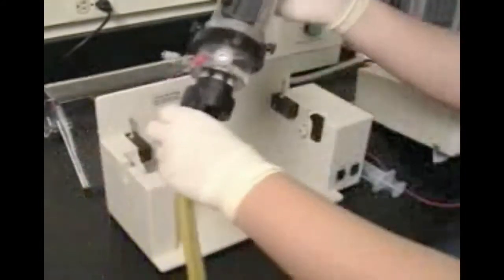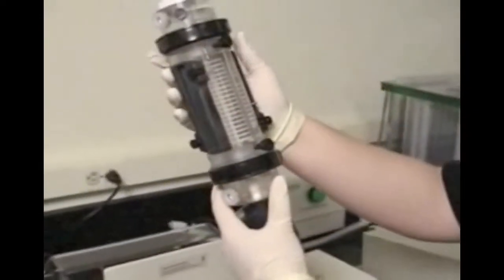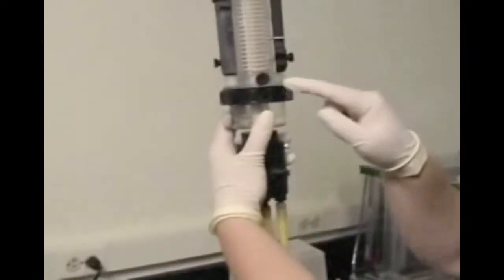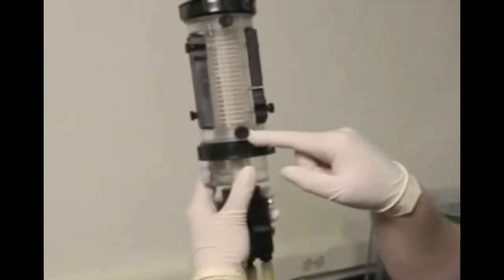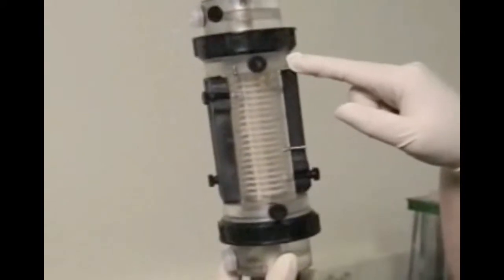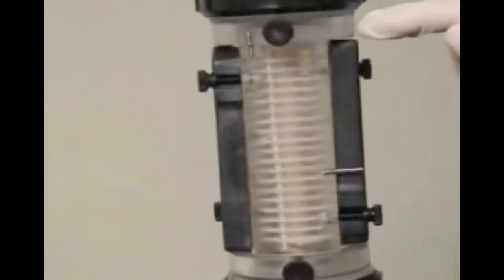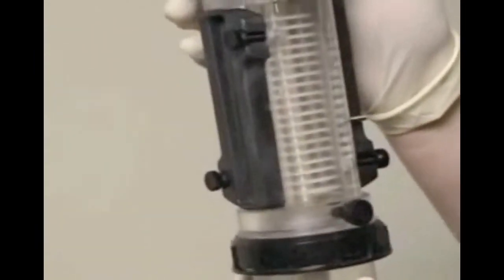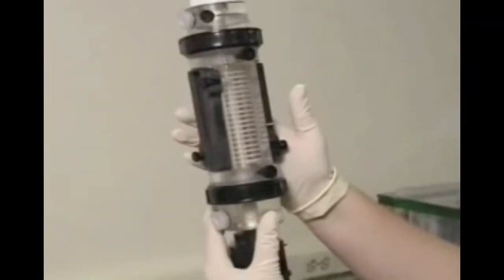During sample loading, air bubbles can become trapped in the six holes that connect the electrode chamber with the focusing chamber. These bubbles tend to become trapped within this region right here. Air bubbles cause a discontinuity in the electrical field and fluctuations in the voltage. Some power supplies, such as the PowerPak 3000, may shut off in response to air bubbles within the electrical circuit.